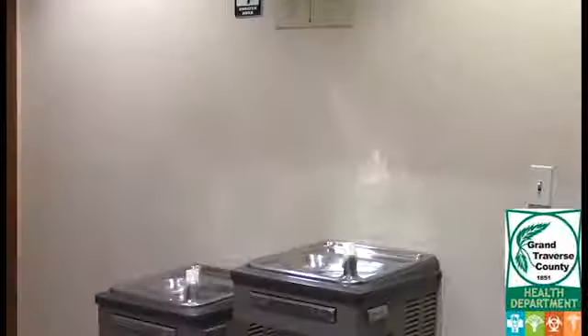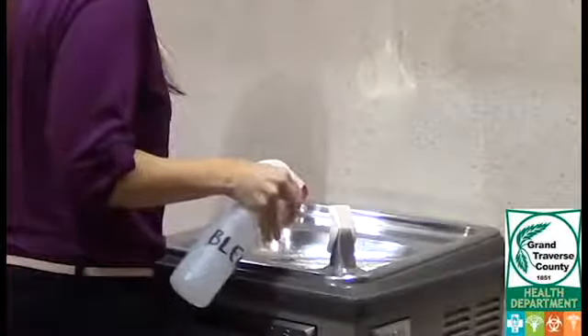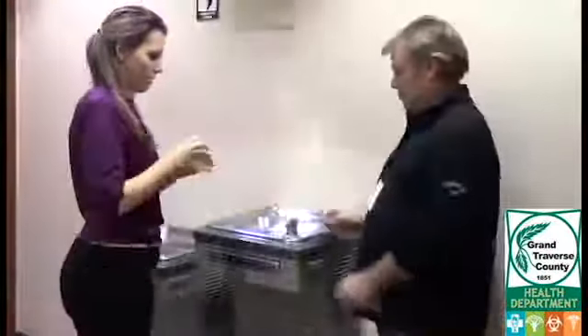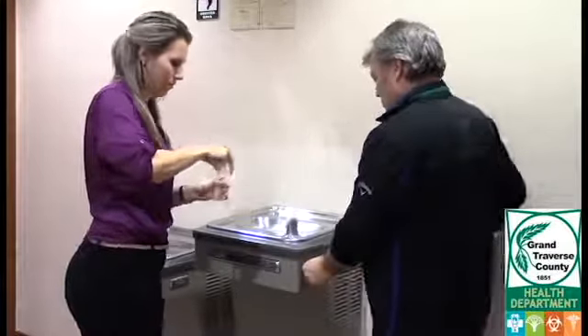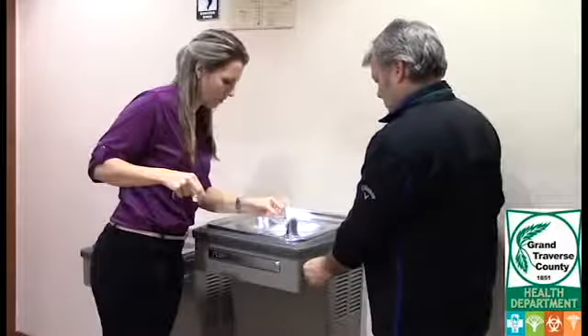If the sample tap you're testing is a drinking fountain, you'll need to clean it with a spray bottle filled with the same bleach and water solution. For the actual sampling at a drinking fountain, you'll need help — that way someone can turn on the water while you hold the sample bottle and cap.